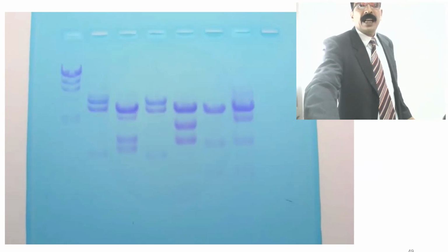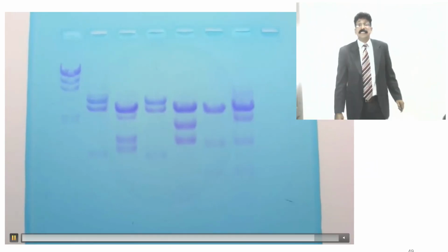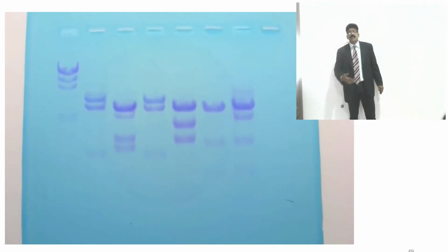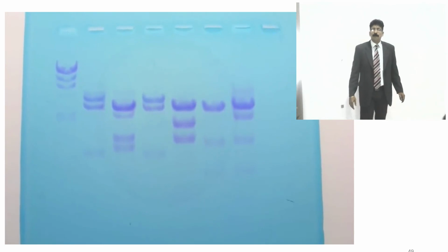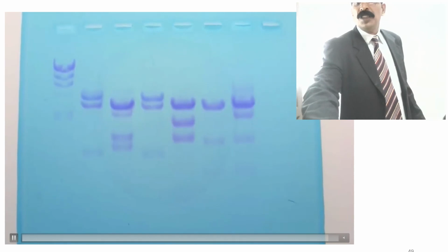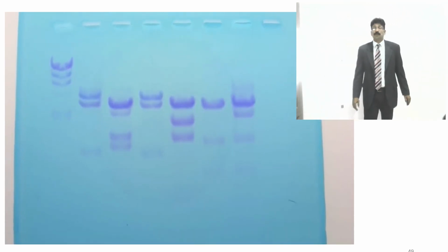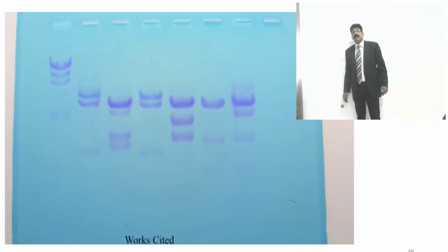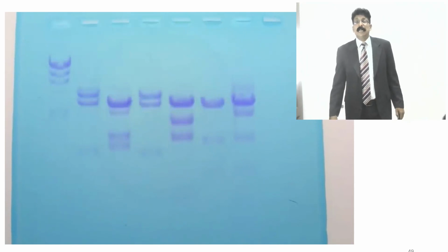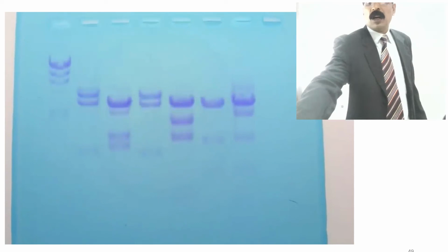So very clearly it shows that both are the same sample. And you can even go for a very clear picture 2-3 times. If you want to perform it, you can perform it and you can confirm this experiment very clearly. So this is how they will use DNA fingerprinting by means of the electrophoresis method, which is very commonly used in herbal drug standardization. So that's why I have taken this also along with the HPTLC.